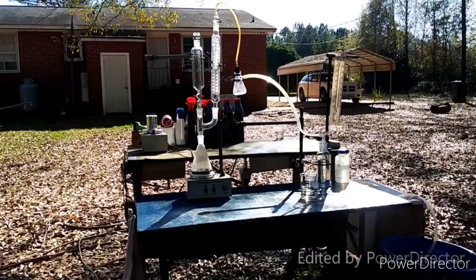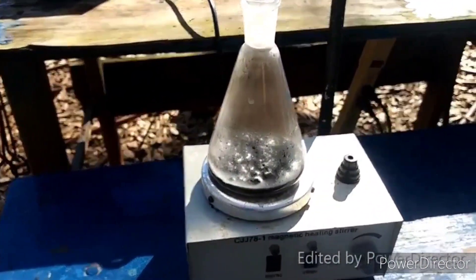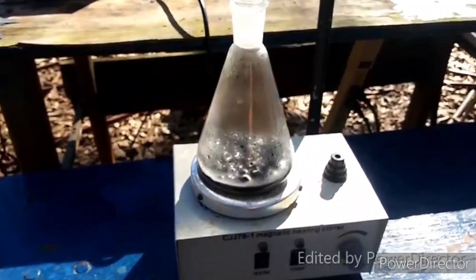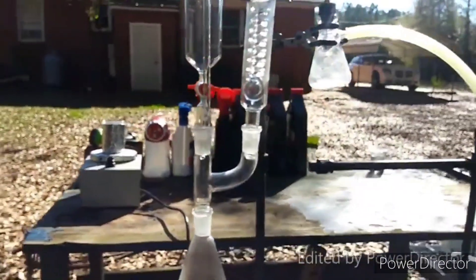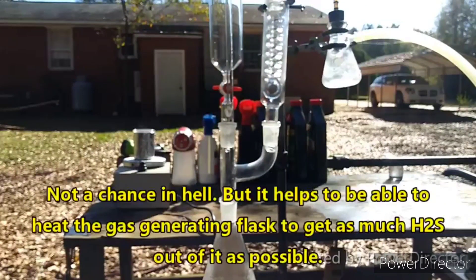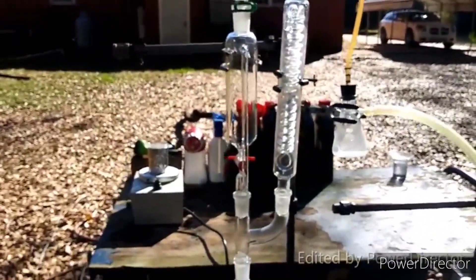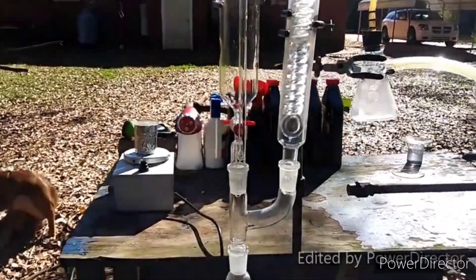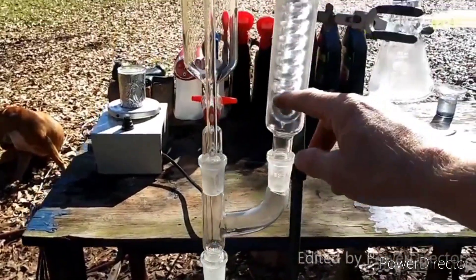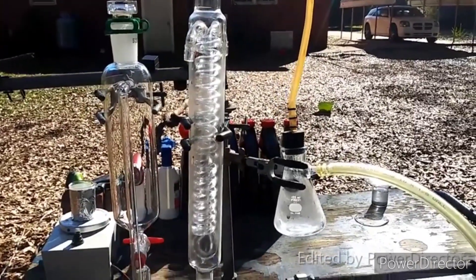Here is the setup I'm using for the reaction. I have ferrous sulfide in the flask with a little bit of water to facilitate the acid mixing. There's a lot of iron in there so I very much doubt it's going to stir, at least not for a while. The addition funnel is where sulfuric acid will be added, then the gas will come up through this adapter and up through this column, which is not connected to any cooling water.